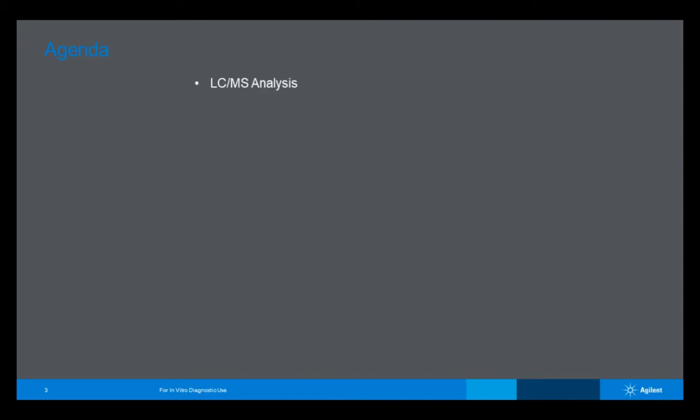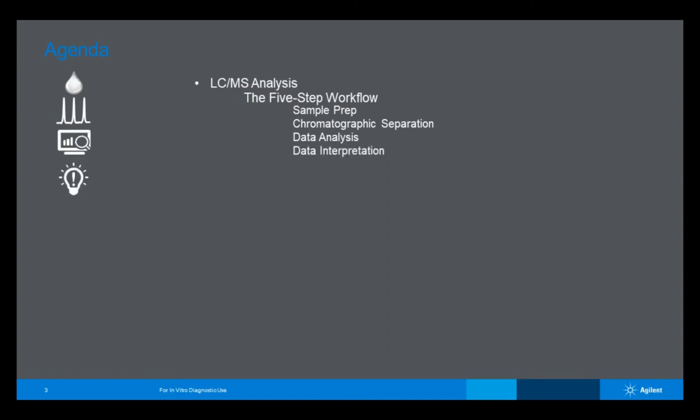For today's agenda, we'd like to first start off talking about LCMS analysis, and I like to talk about that in the context of a 5-step workflow. Those steps are the sample prep, the chromatographic separation, the data analysis, data interpretation, and reporting. I also like to think about that same 5-step workflow over a 3-phase life cycle, specifically the method development, method validation, and routine analysis phases of the LCMS analysis workflow.